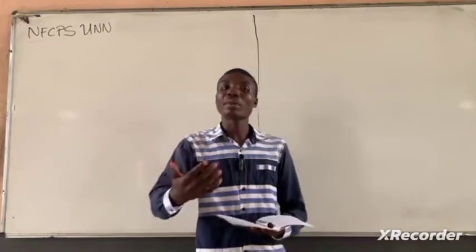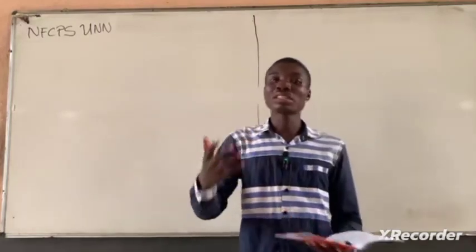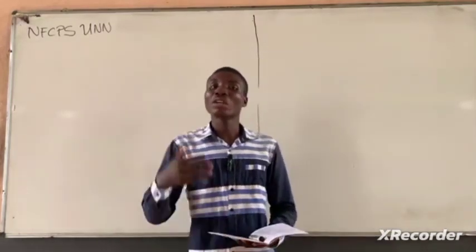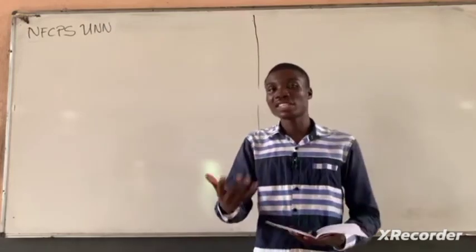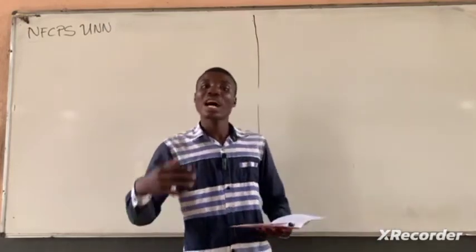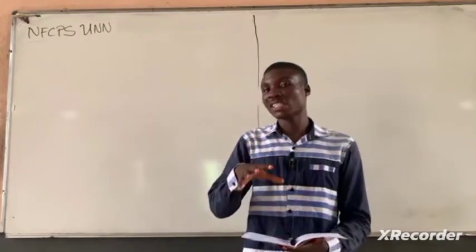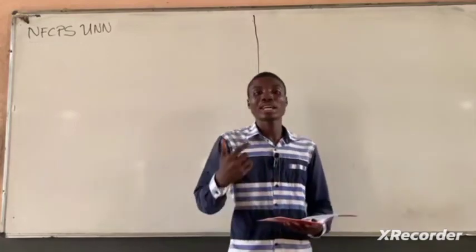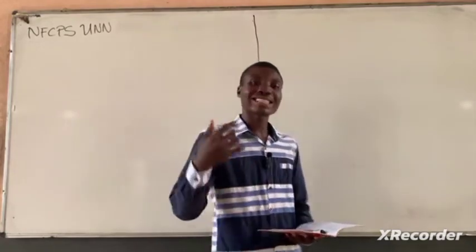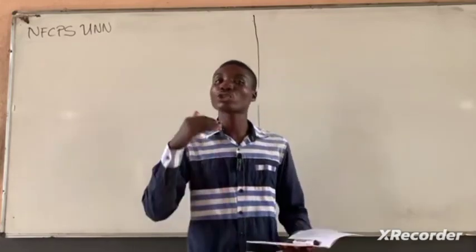That's autonomic pharmacology. You must have been able to understand the drugs that work on the sympathetic system, the drugs that work on the parasympathetic system, the drugs that work on the muscarinic receptors, the nicotinic receptors, and so on and so forth. Because with your basis of the understanding of these drugs, that is how you are able to carry out the experiment, or if it's an alternative to practical, that's how you're able to understand the experiment you're carrying out and be able to give the right kind of report you ought to give.